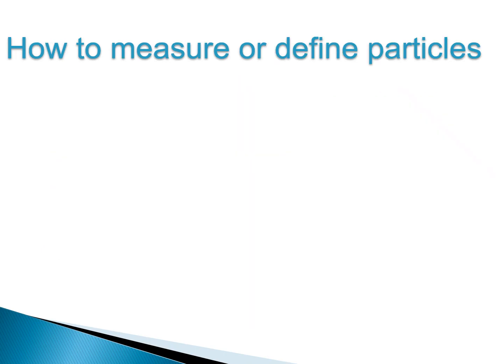One of the important factors in how to make this measurement is defining the type of particles, or knowing what the type of particles are that you want measured.